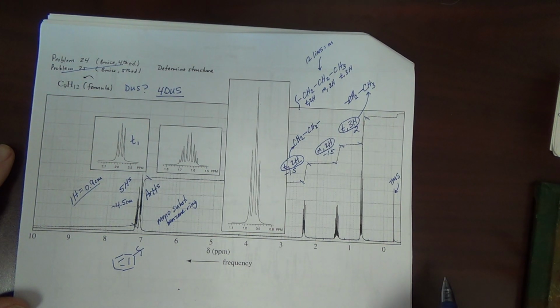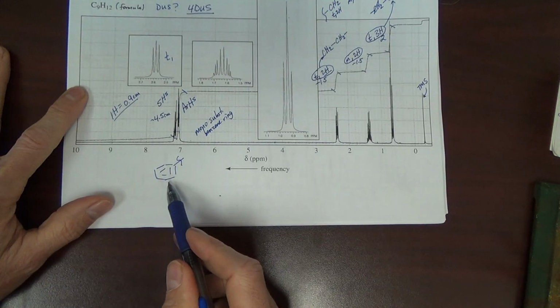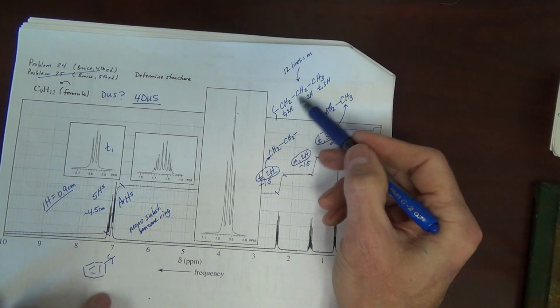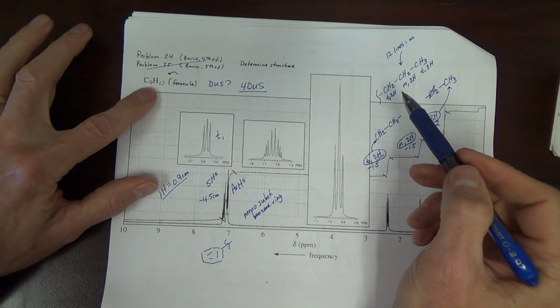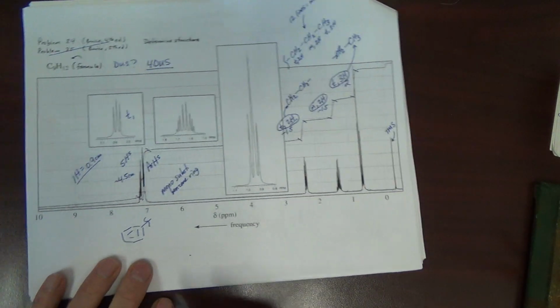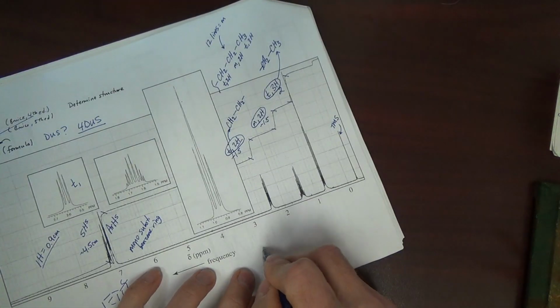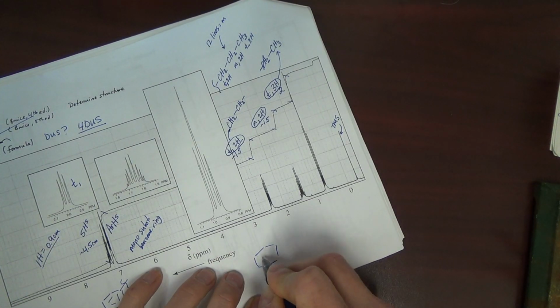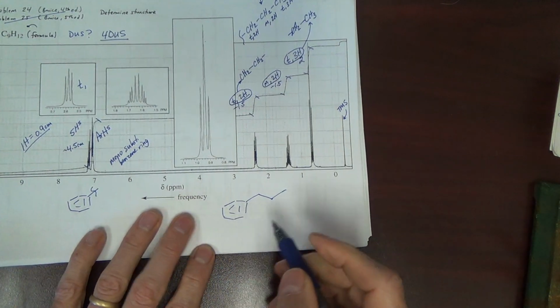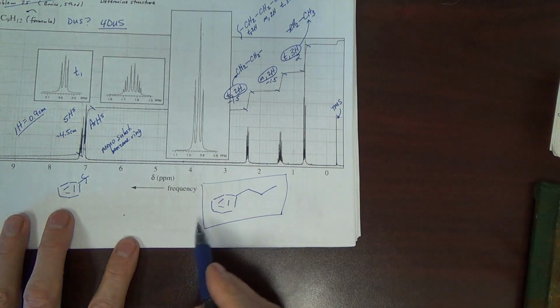All right. We have this fragment, and we have this fragment. That accounts for the entire formula. C9H12 is all here. There's no oxygen, nitrogen, halogen, nothing else. The only thing we can do here is just bond these together. This needs a substituent, that needs a substituent. The answer here is propylbenzene.